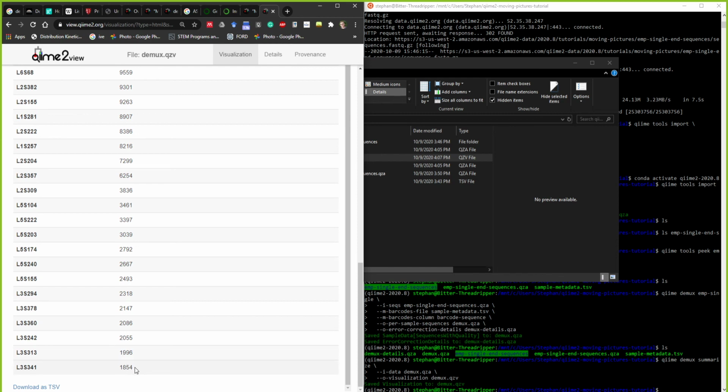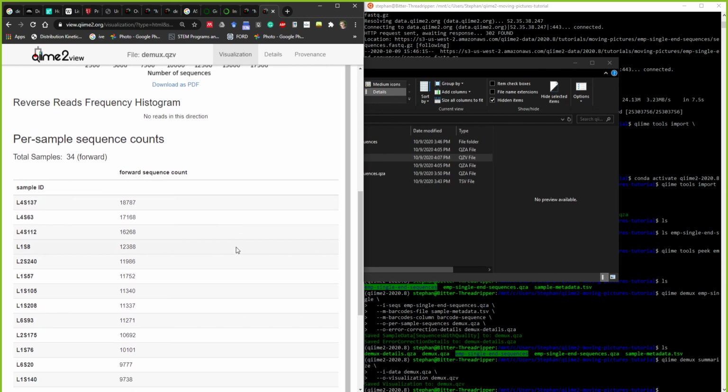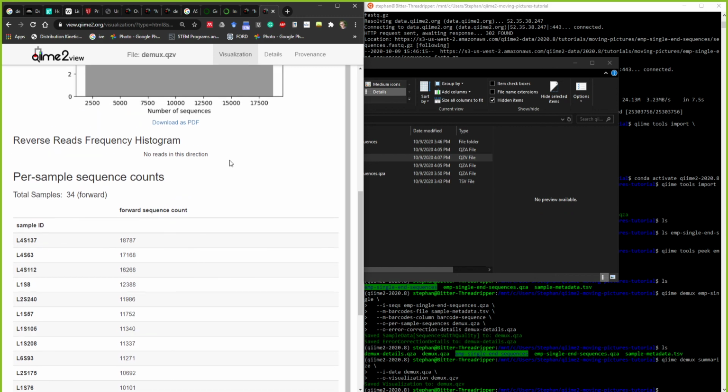And that can be a quality control issue later on, where we'll want to make sure that these are all subset to the lowest value that we can tolerate. So sometimes you'll have samples that don't have enough sequences, so you'll have to discard them. In other cases, you have enough sequences, but you want to make sure that all of the samples have the same amount, so you'll do a randomized subset to make sure that you all have the same sequence count information.